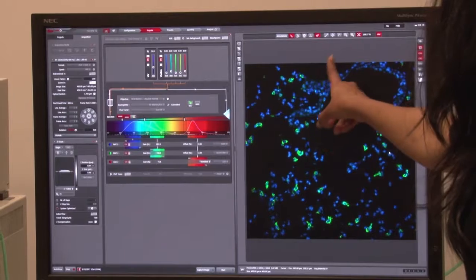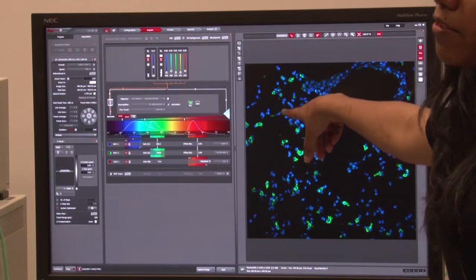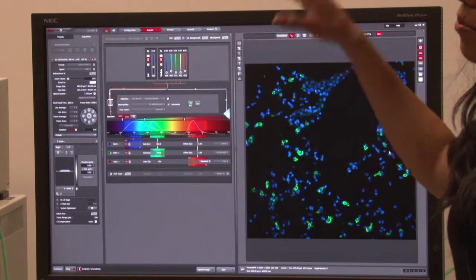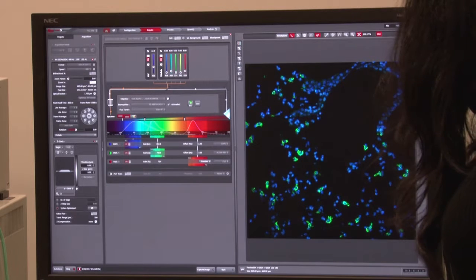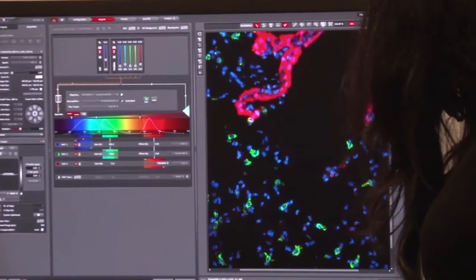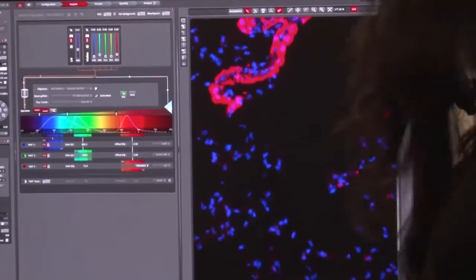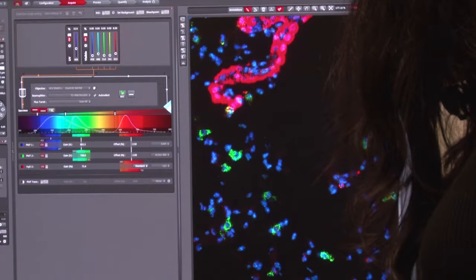At the junction of the airway and the alveolar epithelium are bronchoalveolar stem cells, or BASCs. These usually have both SPC transcripts and secretoglobin transcript. If you can see it, you can see these cells. I can zoom in. They have signal for both red and green. So there are a few BASCs here. There's one here, one here.